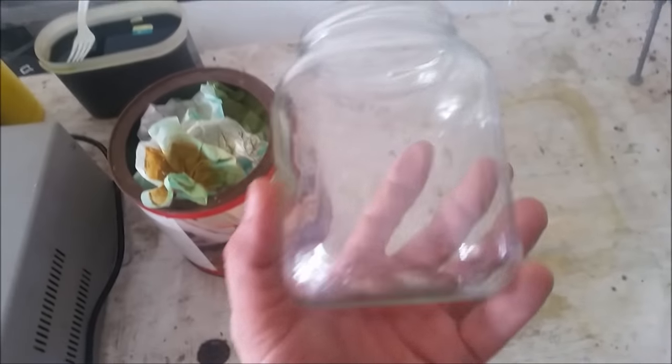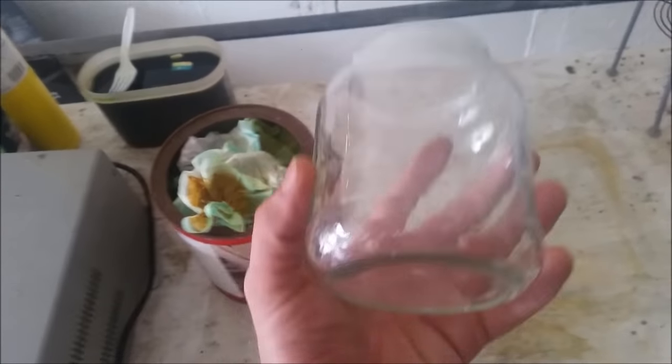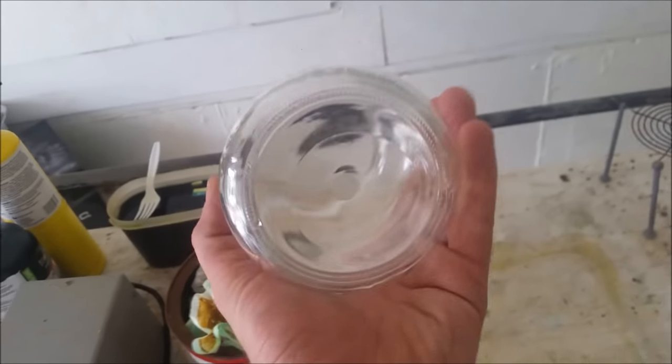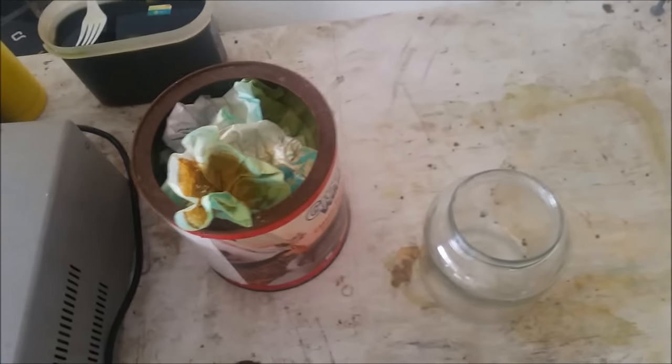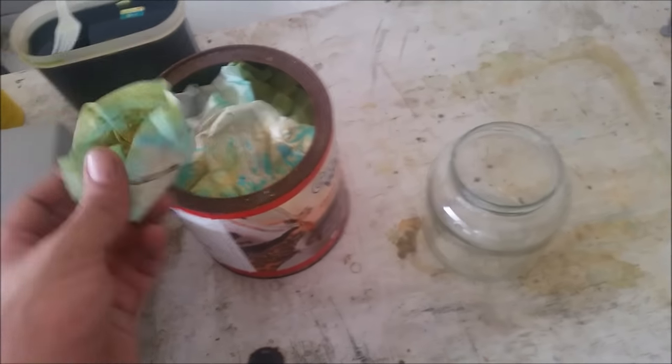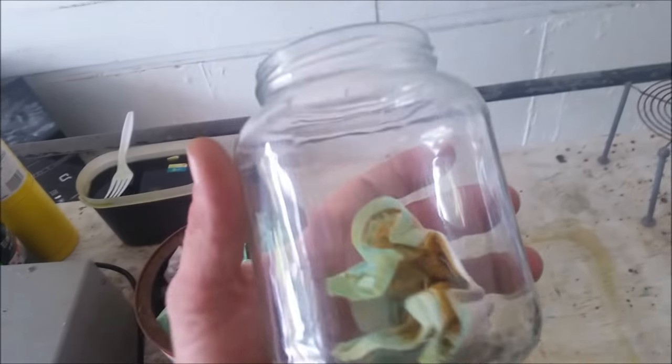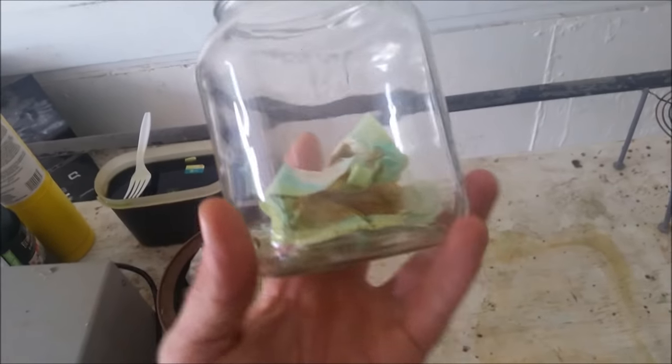So what I'm going to do is I'm going to take this jar. I do use recycled jars for things like this. I have plenty of beakers and I could do this in a beaker if I wanted. However, I've had enough beakers stained with copper and stained with various other things that for projects like this, it's better to just use a glass jar.